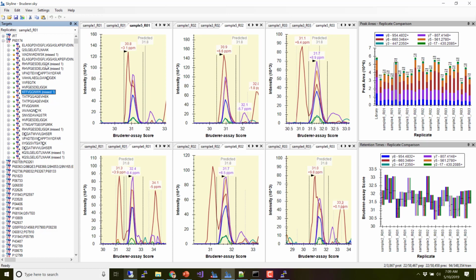Here it caused me less interference, here it caused me a lot of interference, less, more, right? So that adds a lot of variance to my measurements, and especially if there's change happening, these things might not change, or they might change really extremely.